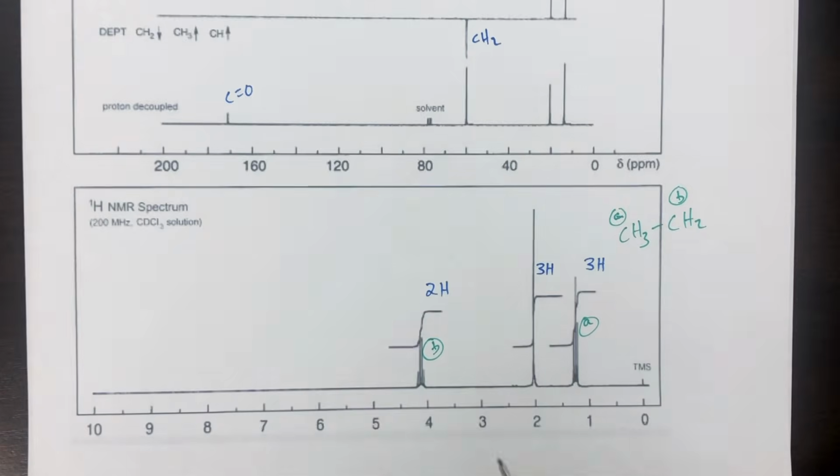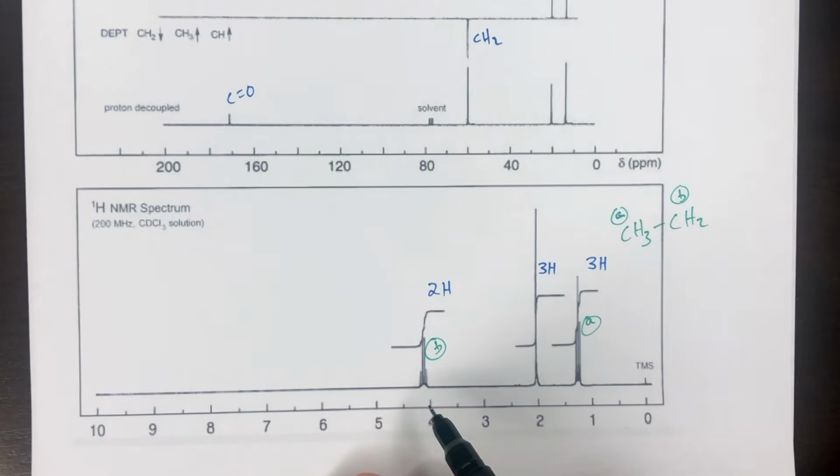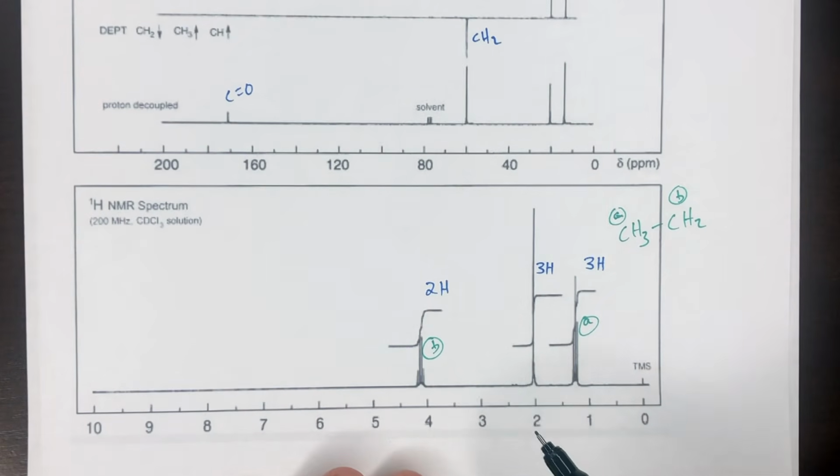So the only thing that's unique about B compared to the other questions that we've seen is that B is shifted very high. So what that means is B is probably not bound to a carbonyl. Because if it was bound to a carbonyl, like we saw in a previous question, it would be 2.5 to 2.7, something like that. It's not going to be all the way up to 4.